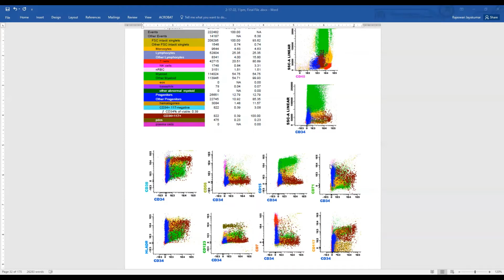The cells painted in pink are the nucleated red cells, which you can see in the table under RBCs. They have the brightest CD71. Our blasts have CD71 similar to the granulocytes. This CD71 here is very noisy, so it looks kind of positive, but you have to compare with the normal control here, which are the nucleated red cells. So they are considered negative here. The blasts are considered negative.